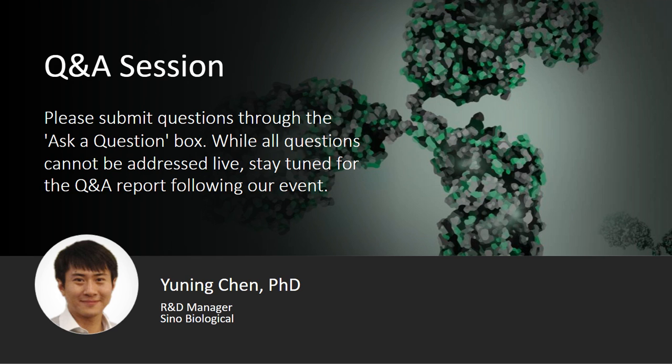Yeah, some really great points there. Shifting gears a little bit, how do you choose a suitable buffer for recombinant antibodies?